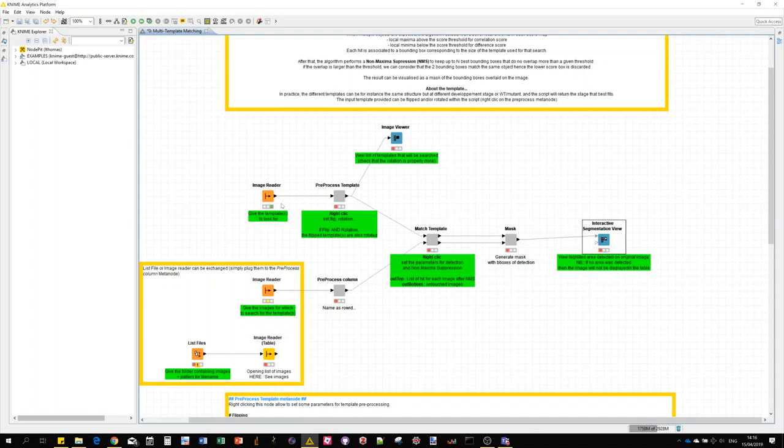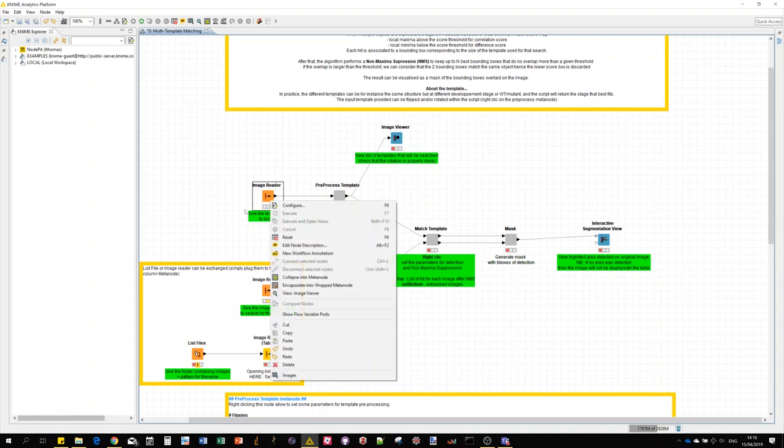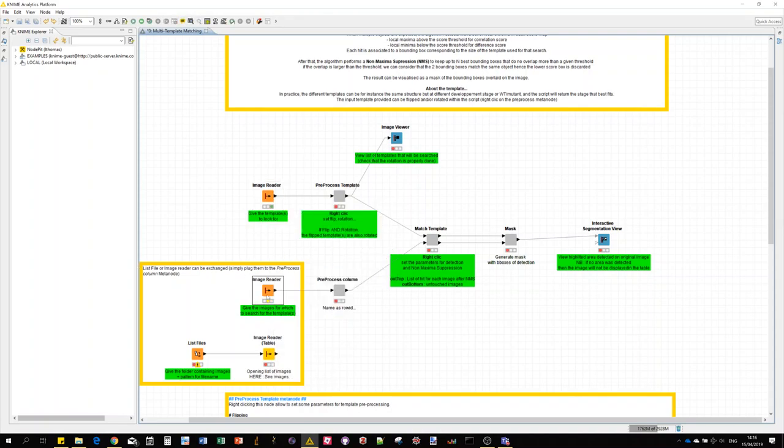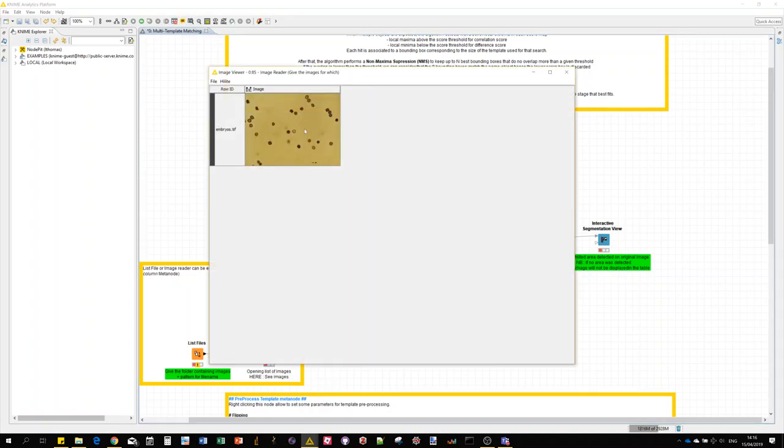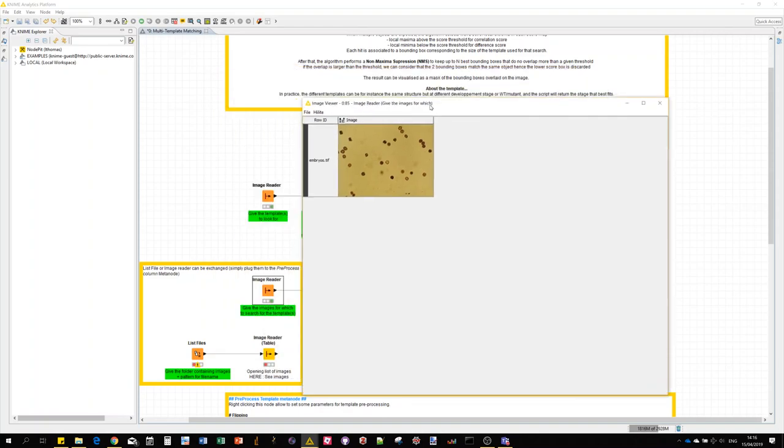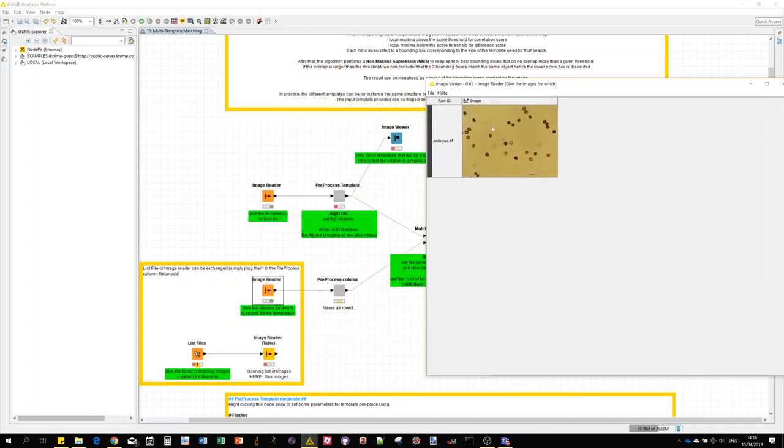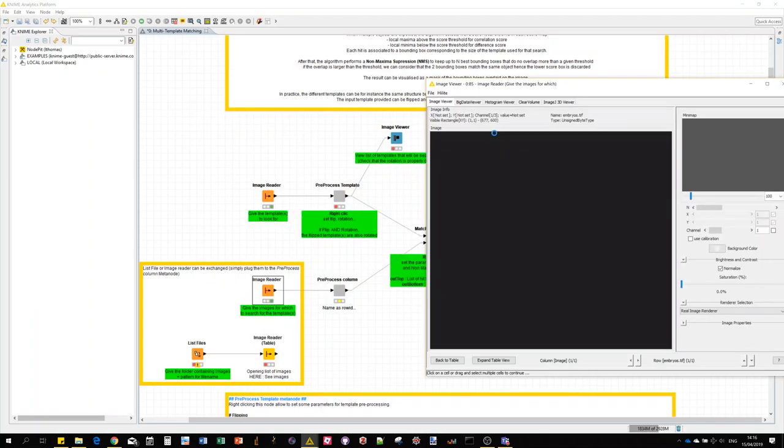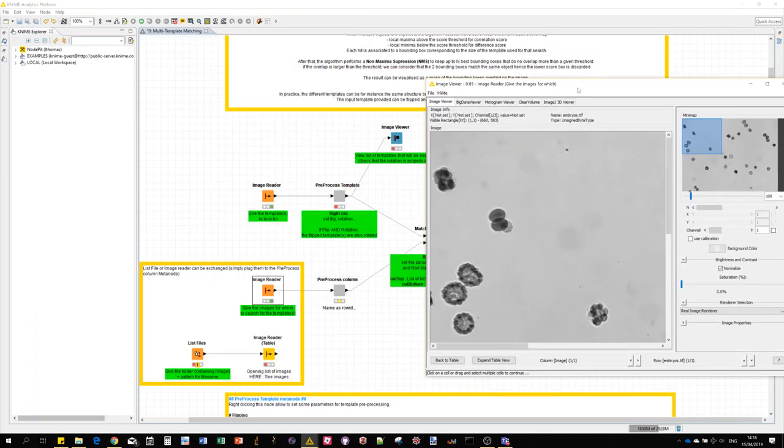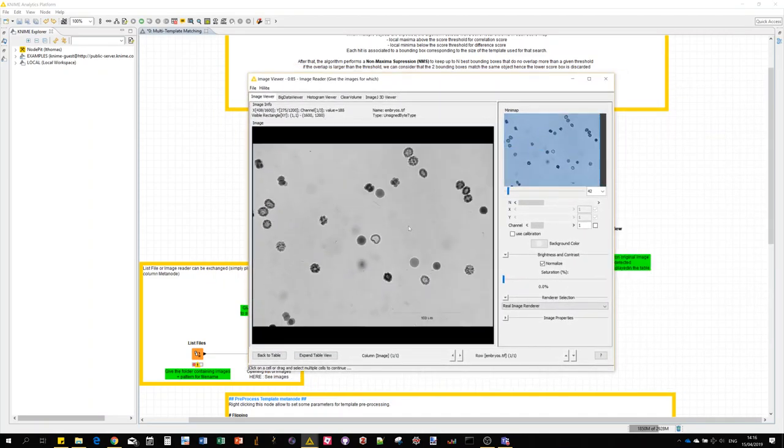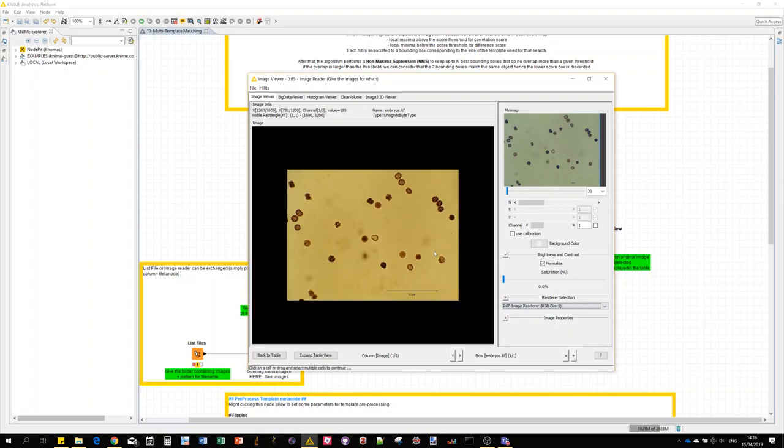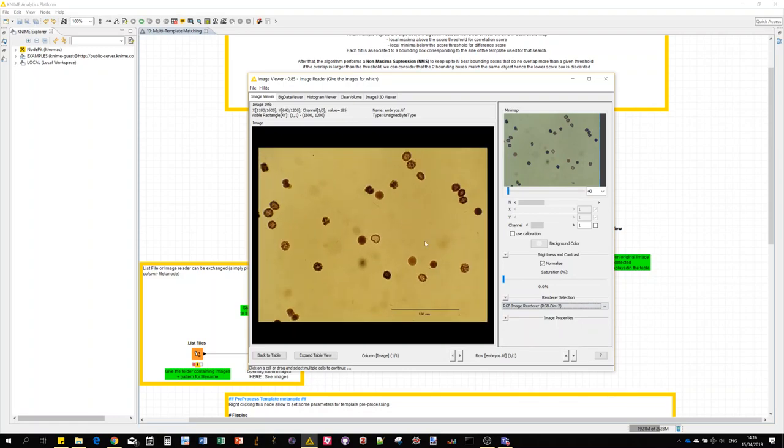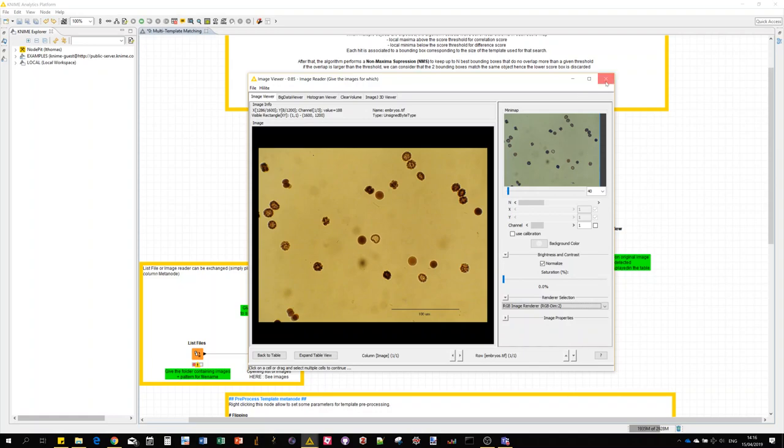Let me show you what image I have here. So this is actually a sample image available with Fiji. It's an RGB image. Internally for template matching, it's only defined for grayscale images, so the RGB images are internally converted to grayscale, but it works transparently for the users.